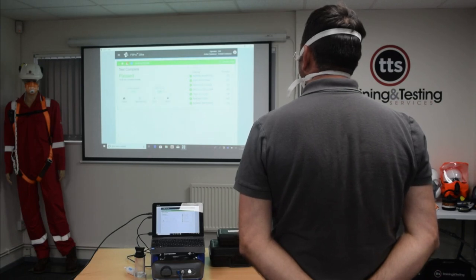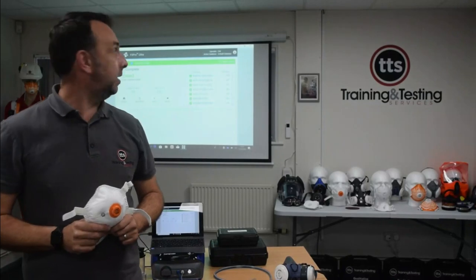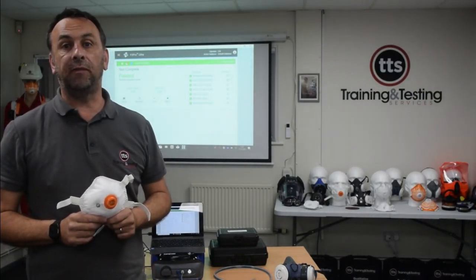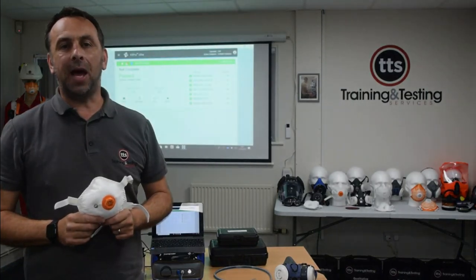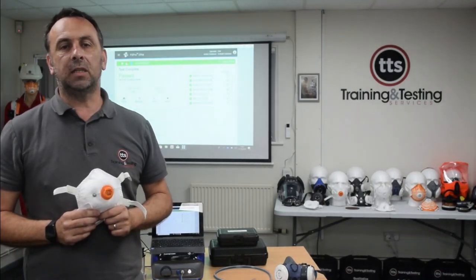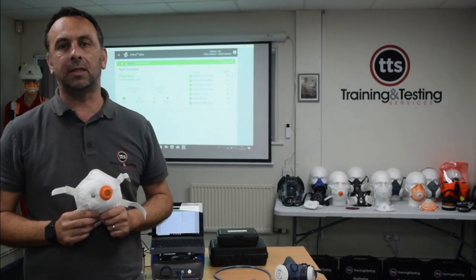And that has quite clearly passed. Okay, so we can quite clearly see that that's a pass. The pass mark is 100 and the mask managed to pass with a fit factor of 775. However, wait till I repeat the test again and I am clean shaven and we will see what the difference is. That pass speaks more about the quality of the mask than it does anything else. Yep, the facial hair will interfere with the seal of the mask, and we will see that when we test a second time round.